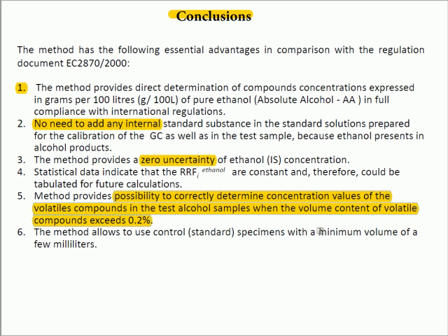Here appears another advantage. The method allows to successfully perform the tasks for a sample of small amounts, for example 1–2 milliliters. Thus, the proposed method, ethanol as internal standard, is an innovative approach in the field of quality control and safety of alcoholic products. Implementation of the method requires less labor and time cost compared to the traditional one. Obtaining accurate values by this method indicates the need to recognize it as a reference one.